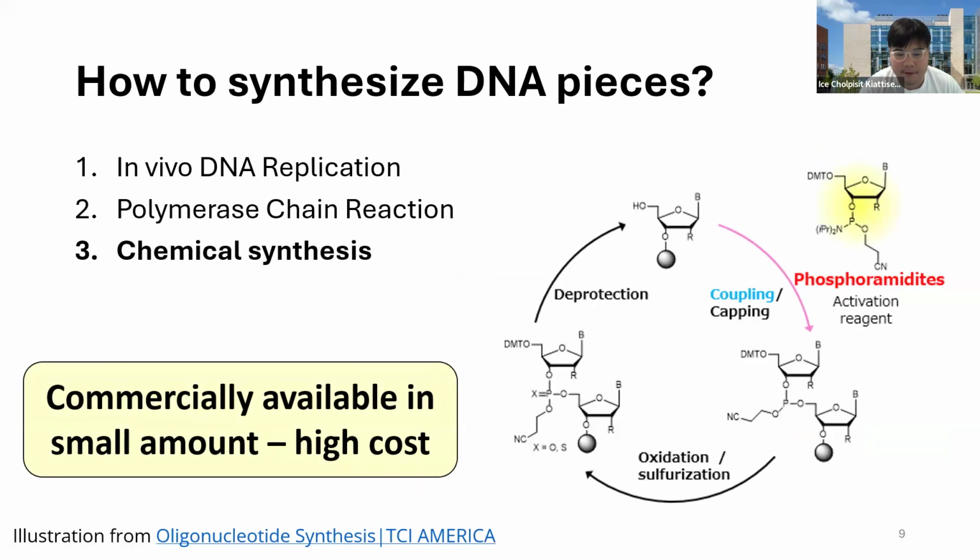And the third one is something that has been a pretty big disruption to the field, because it's getting a lot cheaper, even though it's a relatively high cost process, which is synthesizing the DNA through chemical synthesis. The good thing about this is that you can just order some piece of DNA, and it will come to the front of your lab in not too long, and you can ask for almost anything as long as it passes through the synthesis and the safety processes that they have.